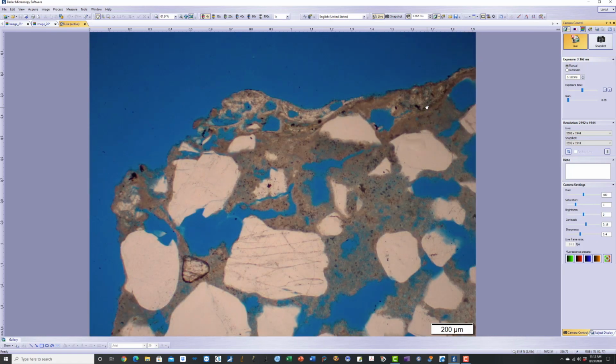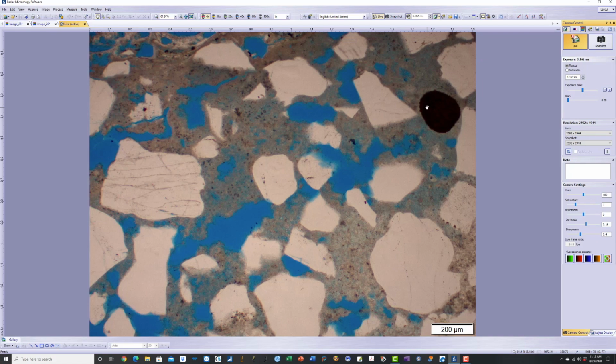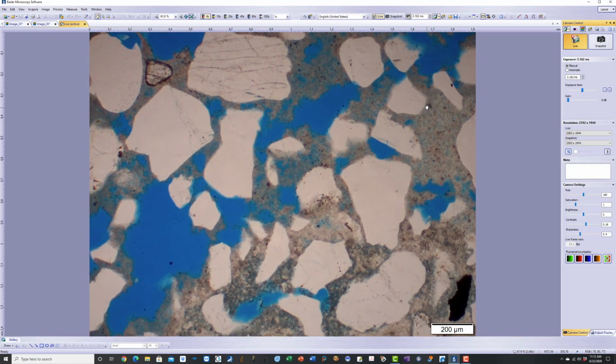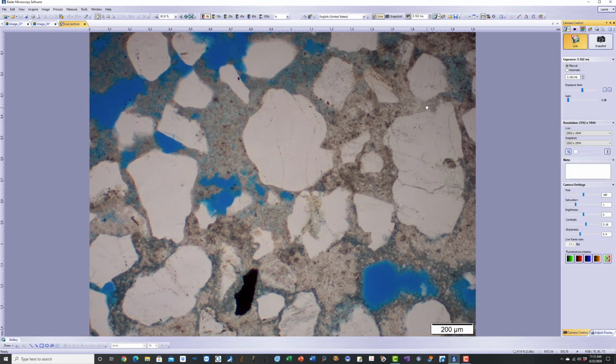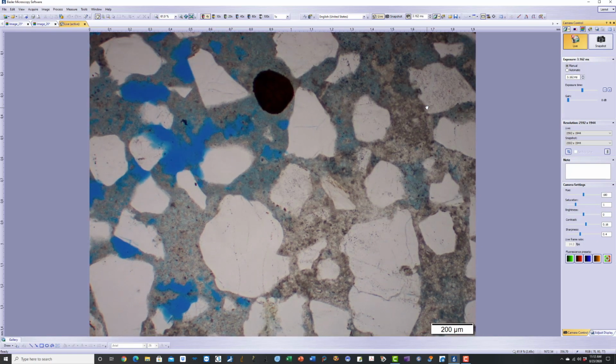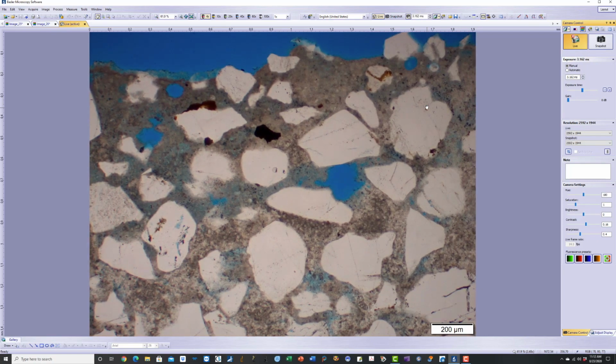And this is a jointing mortar. This is Portland cement and silica sand based mortar. This is 1 part cement to 2 parts sand, no lime, just cement only, binder 1:2 ratio.